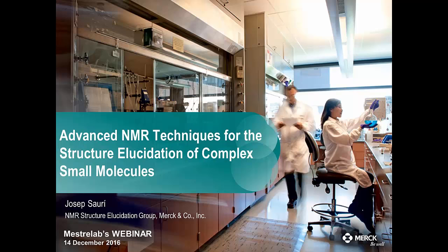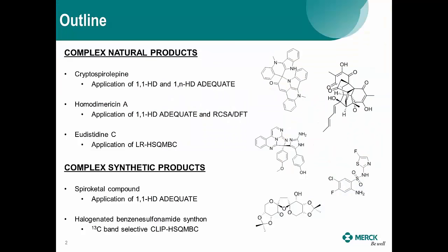The idea of this webinar is to show some examples of the structural elucidation of complex small molecules using non-routine, more advanced NMR experiments. I have been lucky to collaborate with several people in the past 2 years who, in some way or another, have to deal with isolation of natural products and thus with unknown structures. This has given me the opportunity to be involved in some really nice structural elucidation work.